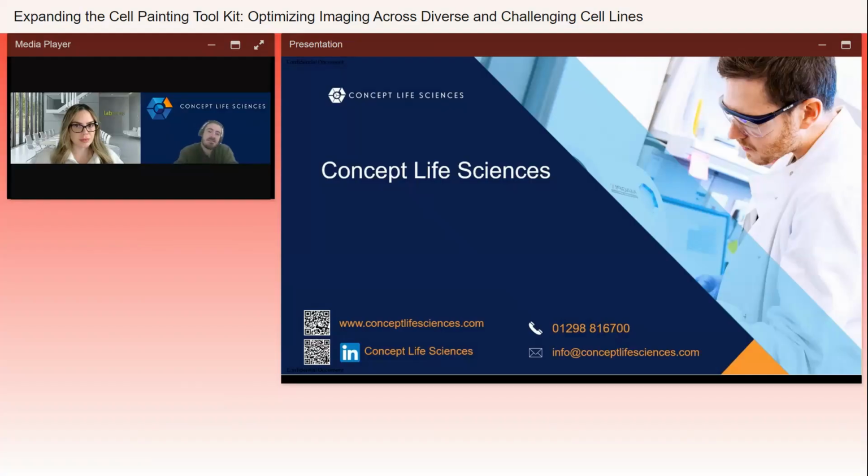You might see that significant autofluorescence is a good indication of cell health as well. If you've got an image that is a small bright spot that's consistent across multiple channels, that's probably a good sign that you have a very unhappy cell phenotype there. But there isn't a specific way to infer viability without changing some of the dyes because of the spectra that are involved.